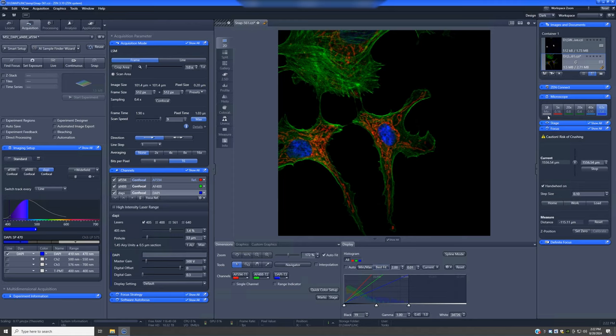The SF refers to the sample finder. This is a feature that you don't really switch to by yourself. This is only used when you use the AI sample finder wizard.